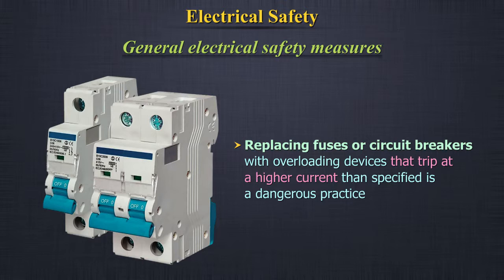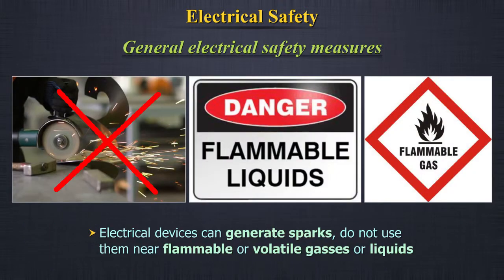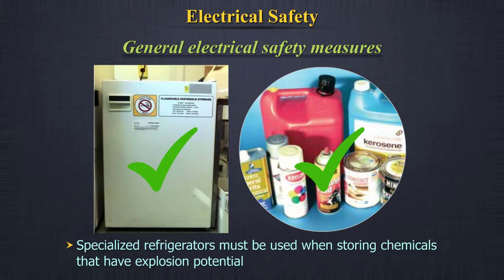Replacing fuses or circuit breakers with overloading devices that trip at a higher current than specified is a dangerous practice. Disconnect equipment attached to high voltage or high amperage power sources from the source, or provide a lockout device on the breaker box to prevent circuit activation before maintenance is performed. Because electrical devices can generate sparks, do not use them near flammable or volatile gases or liquids. Never place flammable liquids in a household refrigerator — the spark generated by the door-activated light switch can ignite fumes trapped in the unit, causing an explosion and fire.